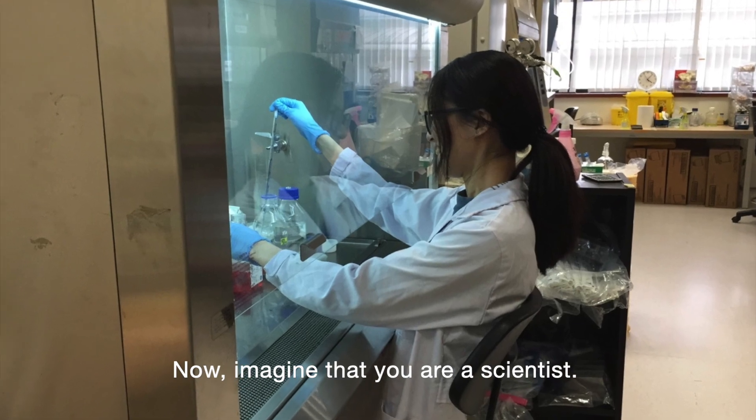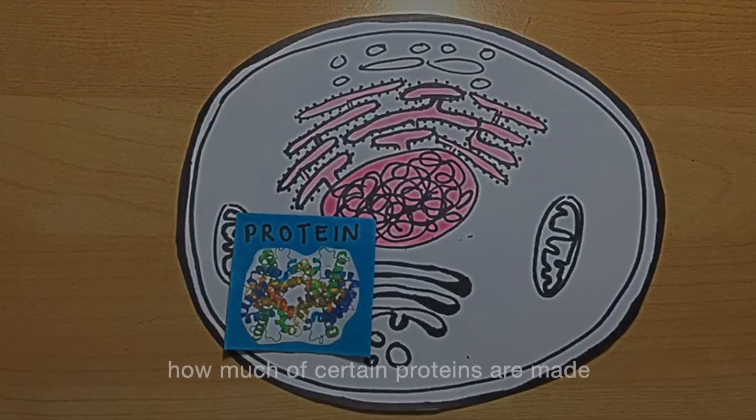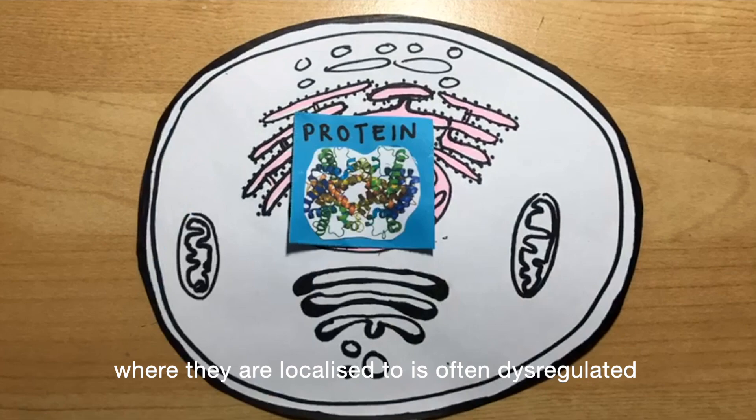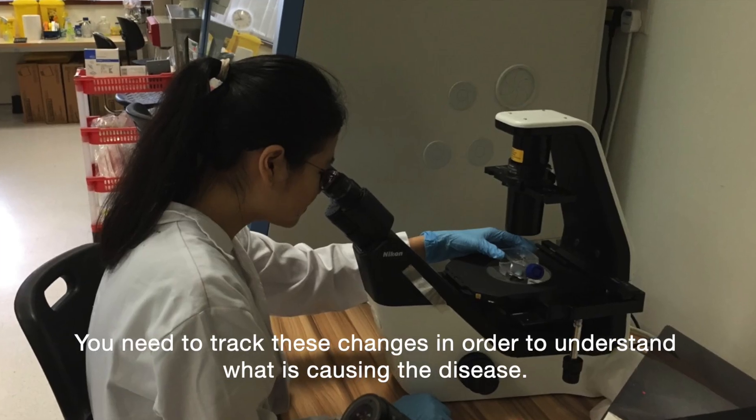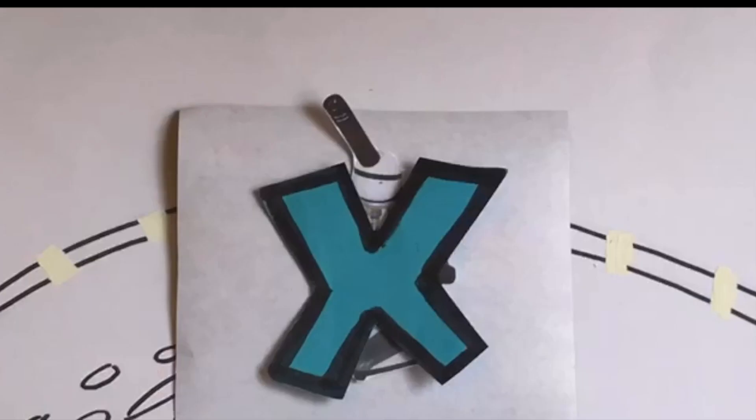Now, imagine that you are a scientist. During a disease like cancer or diabetes, how much of certain proteins are made, or where they are localized to, is often dysregulated. You need to track the changes in order to understand what is causing the disease. But the problem is that proteins cannot be easily observed under the microscope. So what can you do?